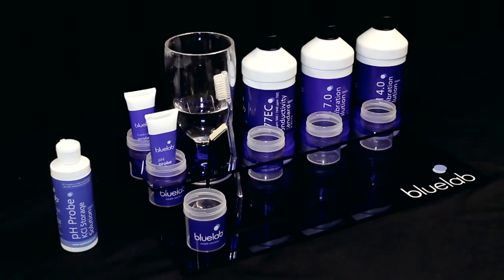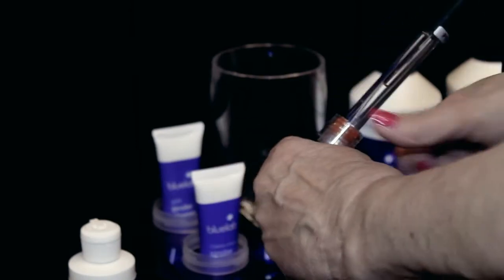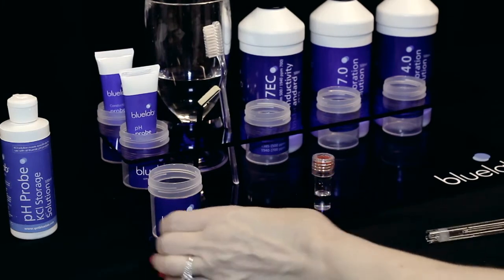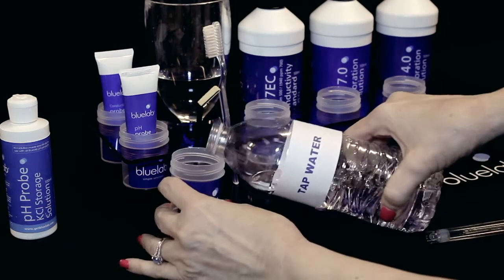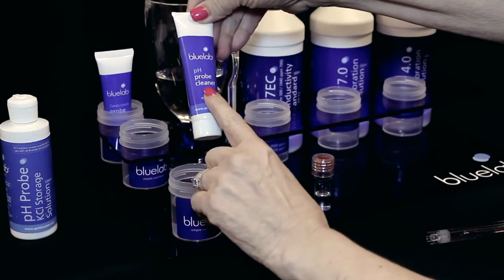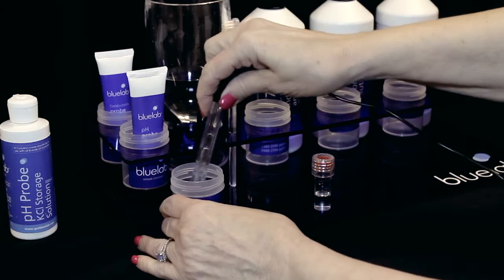We'll start with cleaning the pH probe. Remove the storage cap, grip the base and twist the top one rotation clockwise to loosen a little. Slide the cap off and place cap upright. Fill a plastic cup with clean tap water and add a few drops of Bluelab pH Probe Cleaner. Gently stir the probe in the mixture.